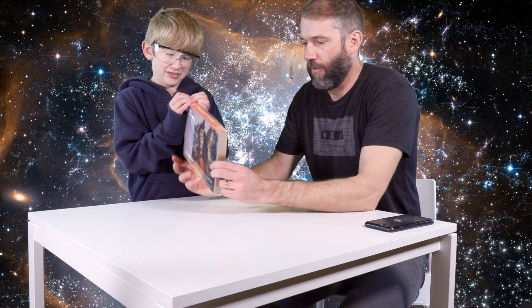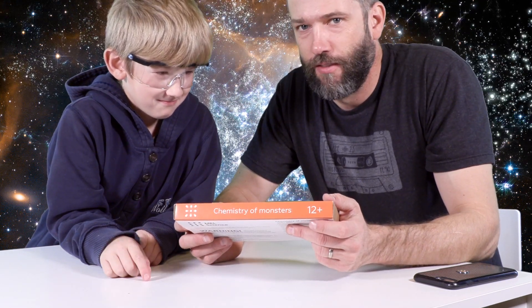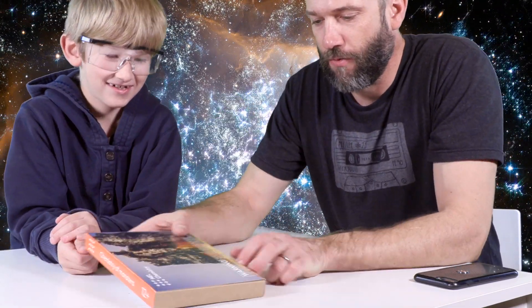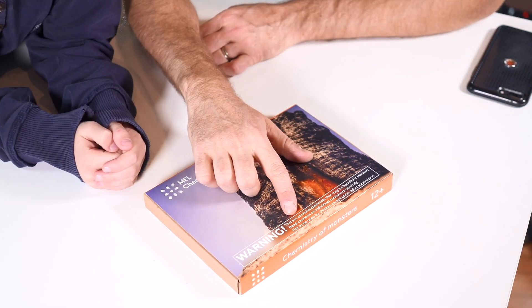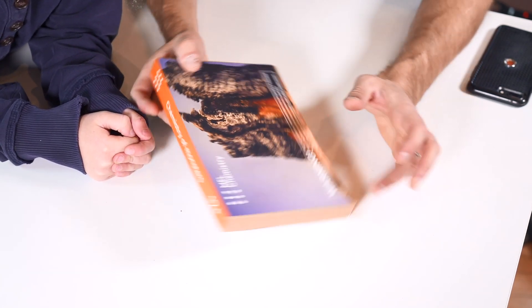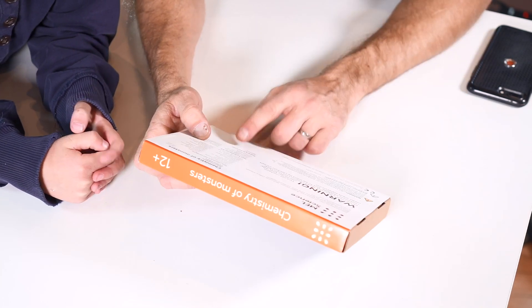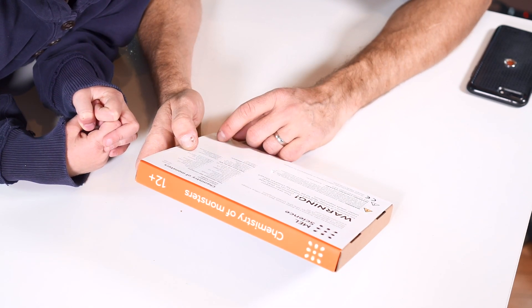Let's show you the other kit — Chemistry of Monsters. Let's open this. This says it is for 12 plus. How old are you? Eight. I guess we can't do this one. Yes, we can. Okay! Chemistry of Monsters. It says: warning, this set contains chemicals that may be harmful if misused. Read cautions on individual containers carefully. There's another warning on the back and a list of the contents. Let's open it up. There's a sleeve — just like a matchbox. Welcome to science.